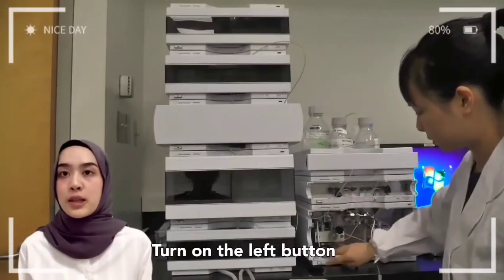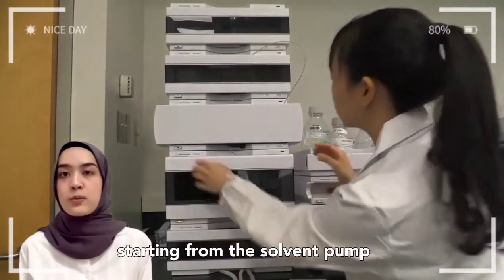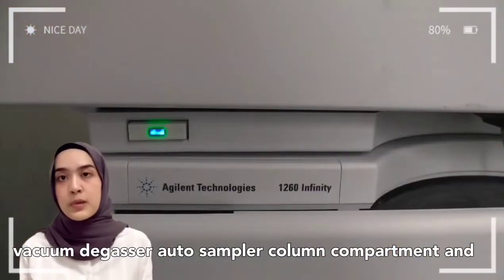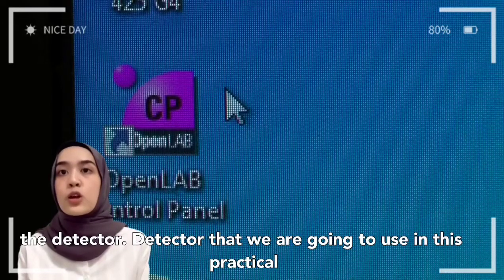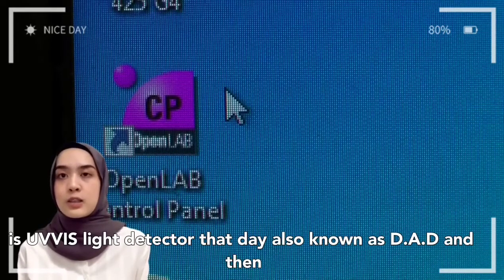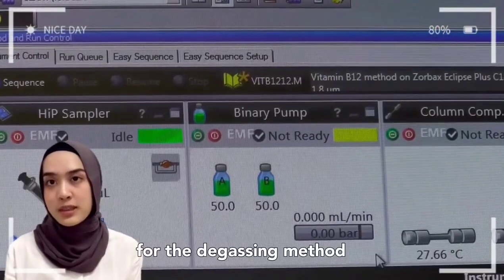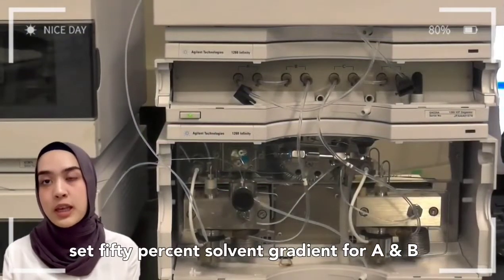Turn on the left button on each module of the HPLC system, starting from the solvent pump, vacuum degasser, auto sampler, column compartment, and the detector. The detector that we are going to use in this practical is a UV-Vis light detector, also known as DAD. And then launch the Open Lab CDS software on the computer. For the degassing method, set 50% solvent gradient for both A and B.